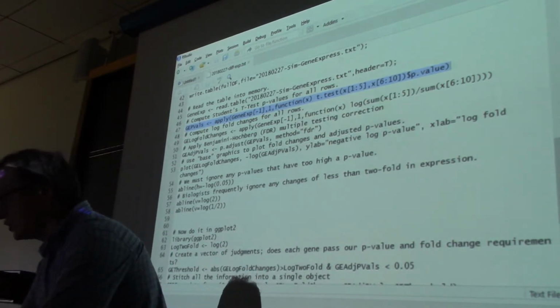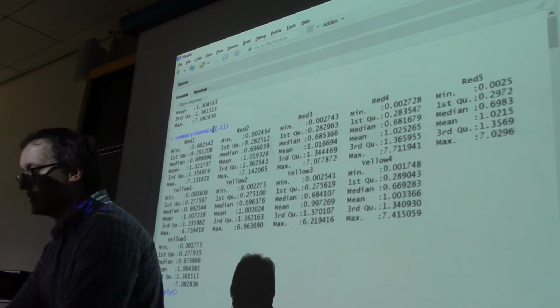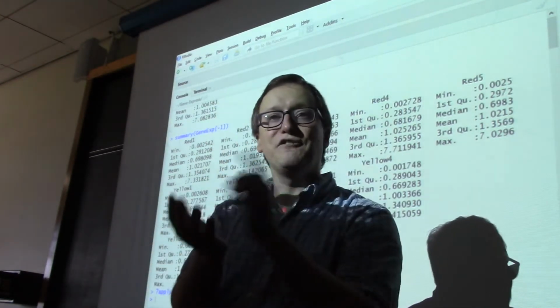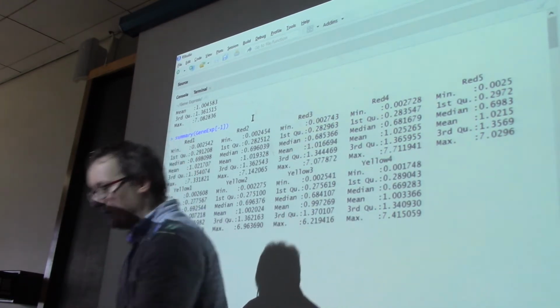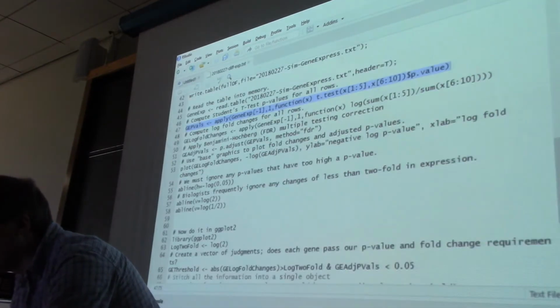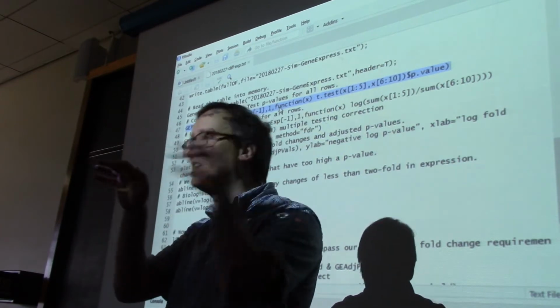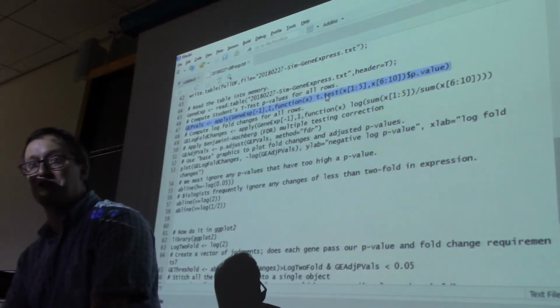Right. So we had a little change pop up between the original gene expression and the new gene expression. Before, the red values were columns 2 through 6. After we ripped away the gene column, though, the new first column is a red value. So this code that we're running is going to strip away the first column, and after it's done that and grabbed out an individual row, the first 5 columns need to get compared to the second set of 5 columns. On those, we run a t-test, just using the t-test command.